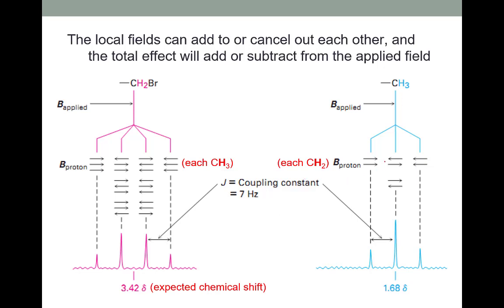It's a little simpler on the other side because our blue protons only had 2 neighboring hydrogens. And so we have the case where they're both spinning in the same direction as the instrument's magnet, they're both spinning in the opposite direction, or 2 different ways we could orient one with and one against the magnetic field. So 1 to 2 to 1 ratio based on 1, 2, and 1. In both cases, these clusters or these signals are centered where we would expect them to be centered, but we see that characteristic triplet or quartet shape of multiple peaks.